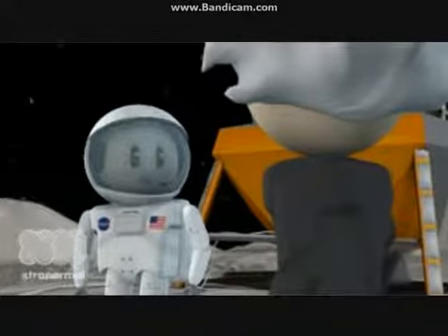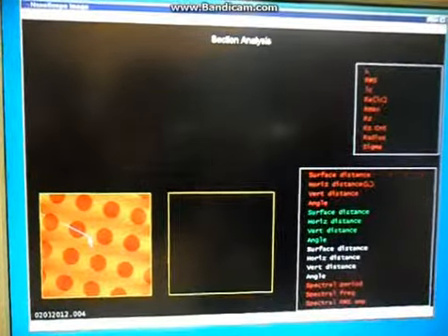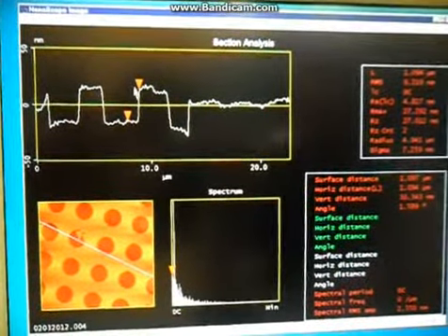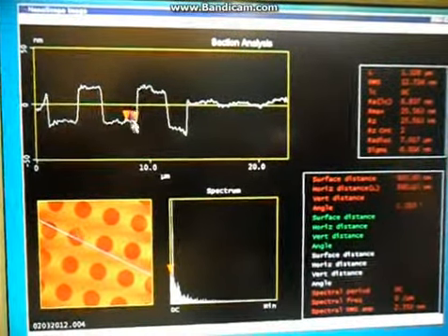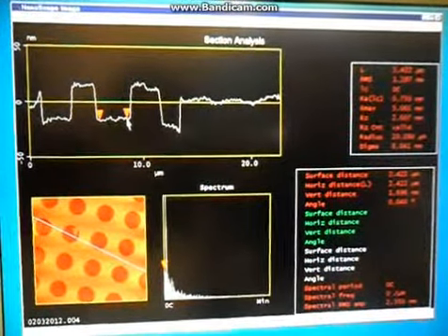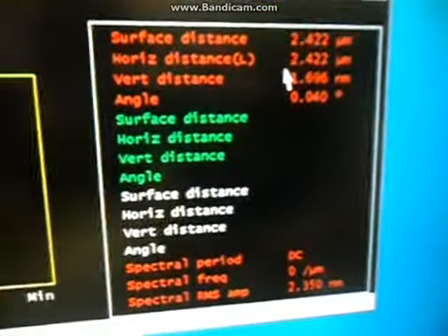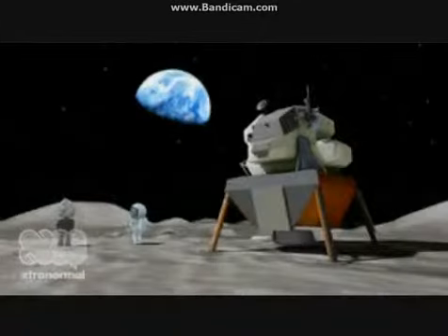Awesome. To add to the awesomeness, I show you here how to measure the diameter of the well. First I draw a line along the diameter of one of the wells. Then watch how I place the 2 orange arrows on 2 sides of the well, along the line. And lo and behold, that's it, we can now read the width of the well.